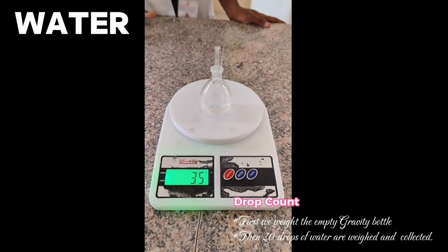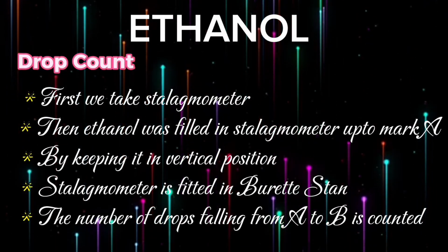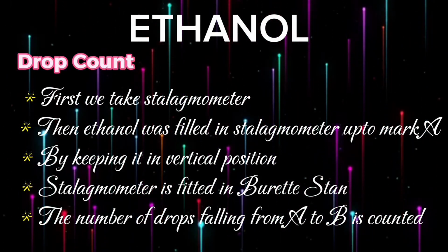Finally, we calculate the values and report it. Then, repeat the same procedure for ethanol and liquid paraffin.